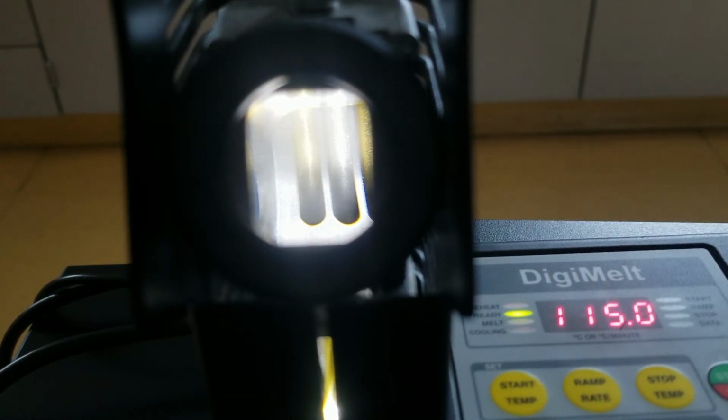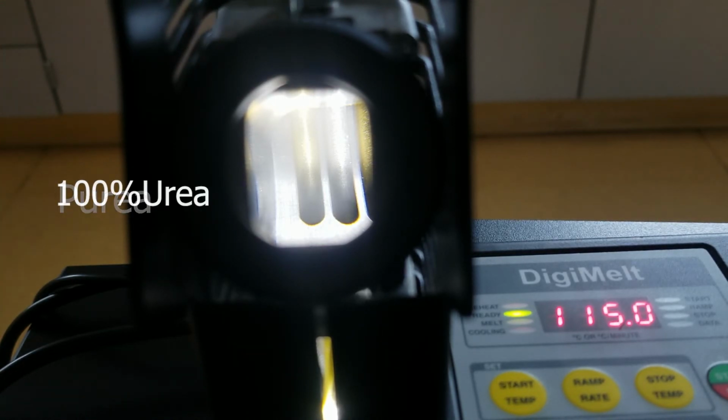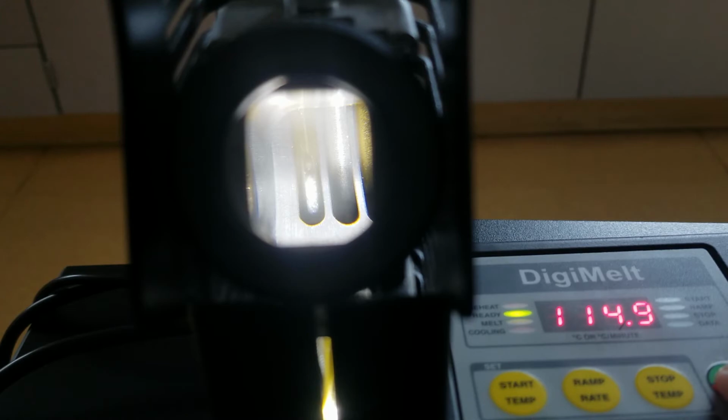All right, we got one more sample to go. Pure urea. Is that what you call it? No, pure urea. All right, let's go ahead and slap it in there and then hit start. Remember, you want to get the start and stop time, so T1 and T2, where it starts to sweat, and then when it's fully melted. It should be about 133.